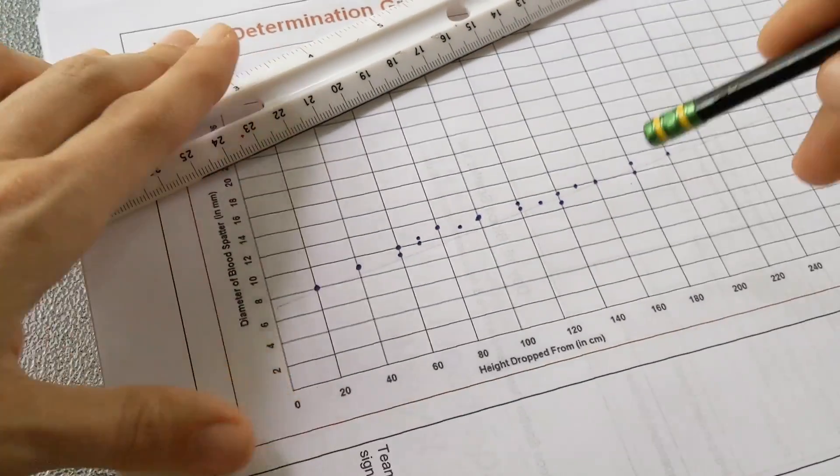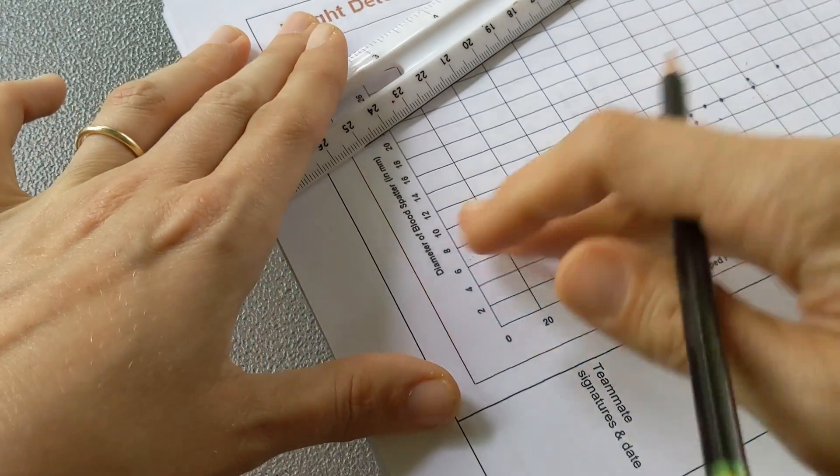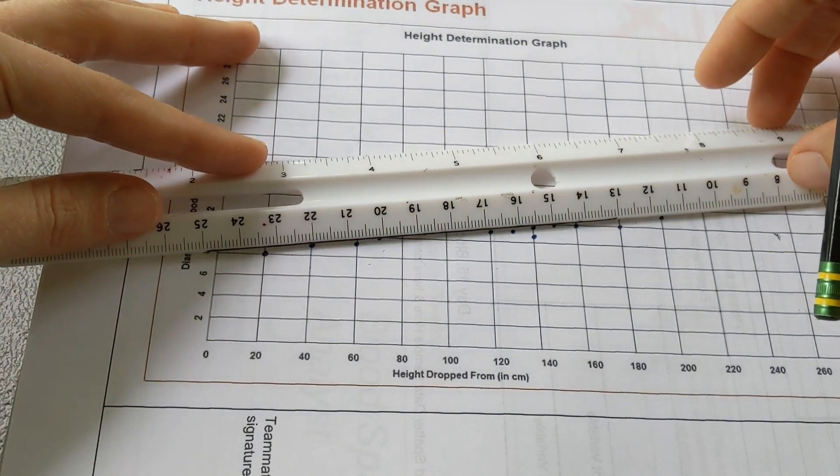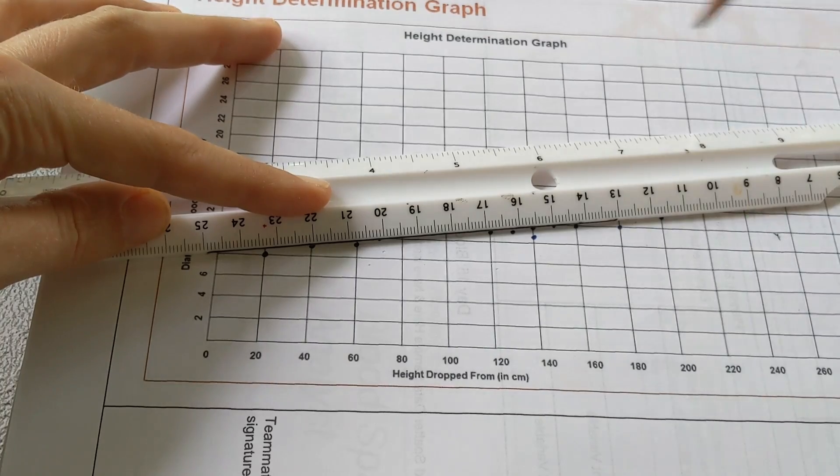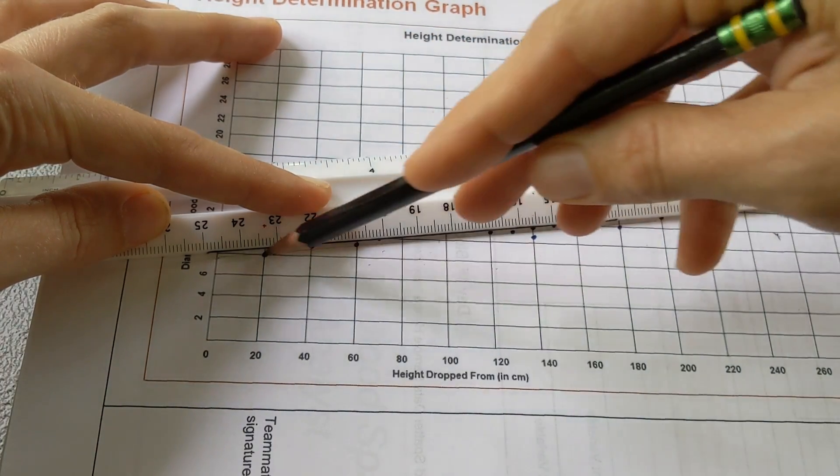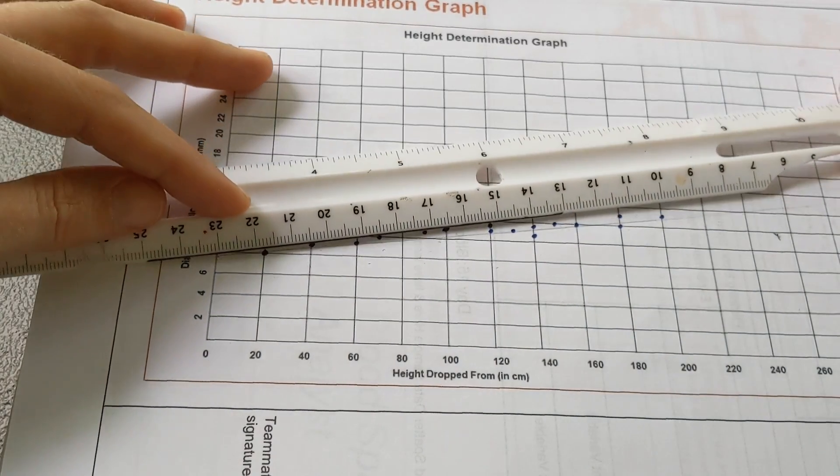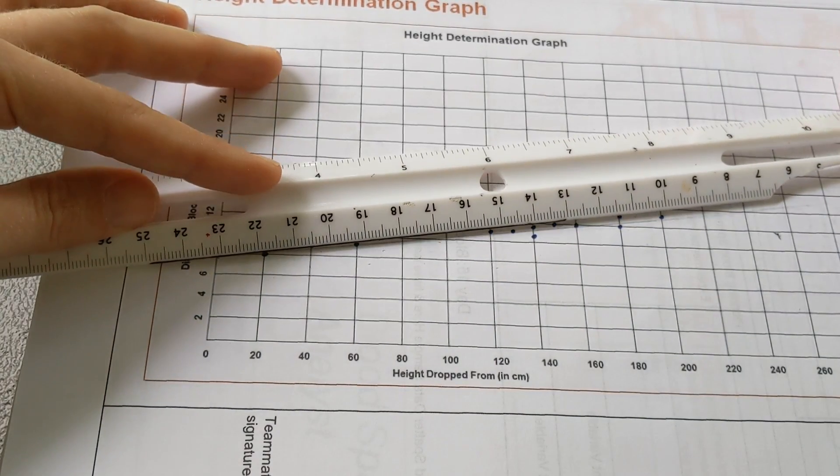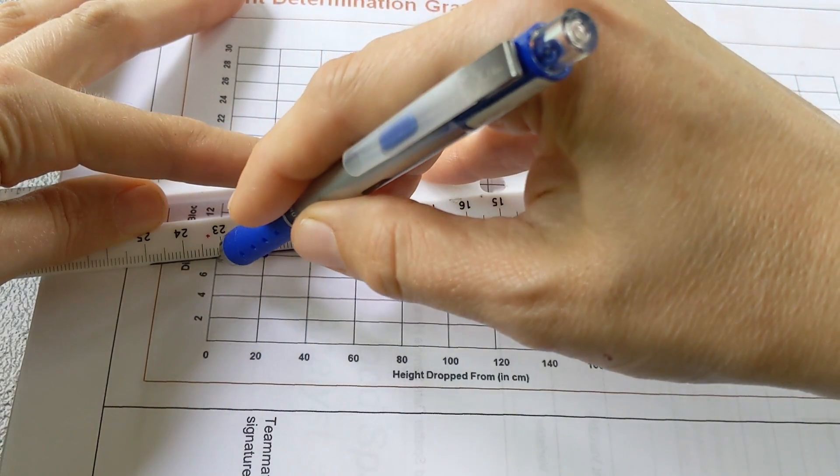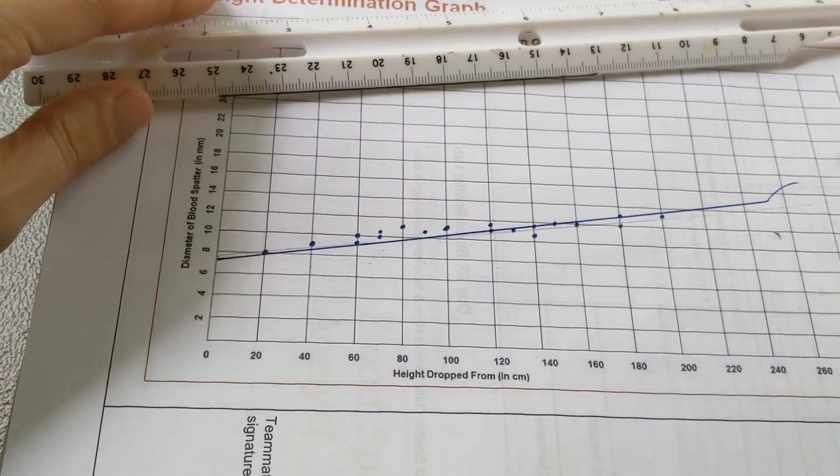It looks to me like I got too many of the dots above the line, so I'm going to go just a little bit higher. The nice thing is that my data points do seem to fall pretty clearly on a line, so I have a clear trend, which is not always the case in this lab. Sometimes the data points are all over the place. I'm going to do it a final time, and this time I'm just going to commit and do it in pen. And that's my trend line.